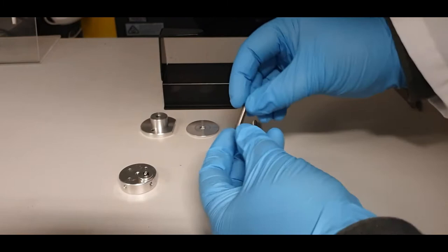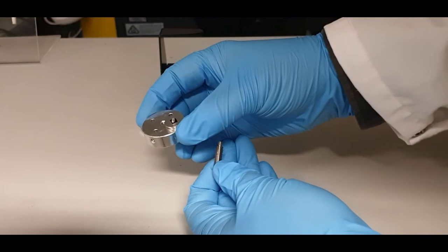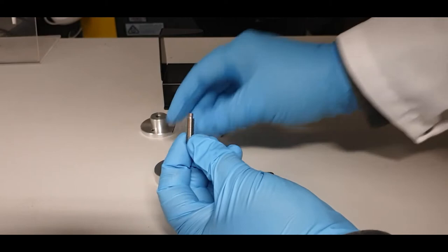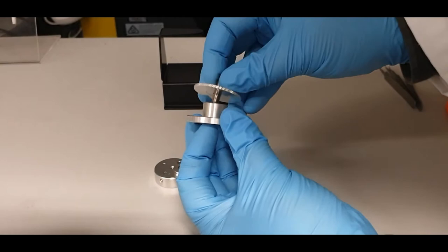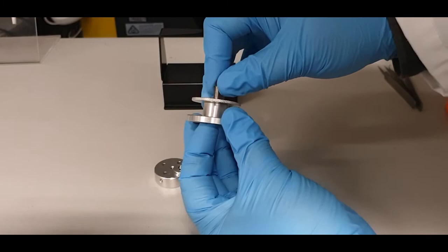Next, you need to take one of the posts — either the long post or the short post. If you are using the pin stub holder with a pin stub and a sample on top, you must use the short post. Take the short post and the locking ring, screw the post into the ring first, and then take the base and screw the post into the base. Then gently lock the post with the locking ring.